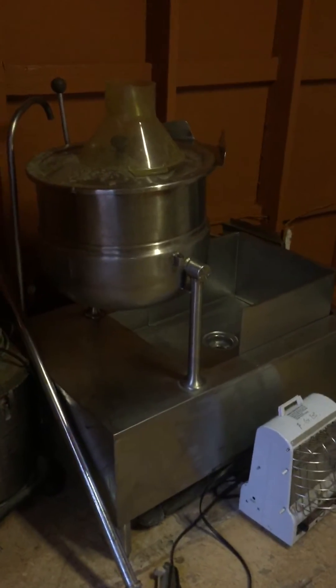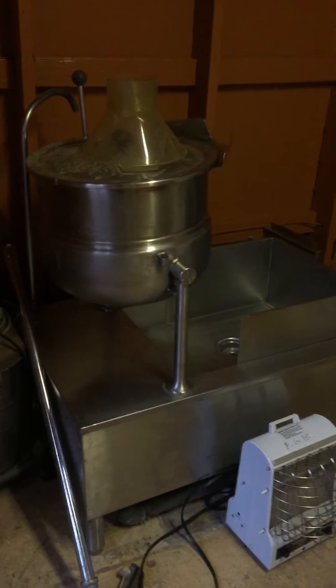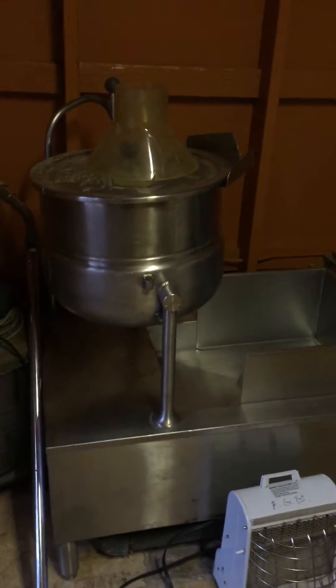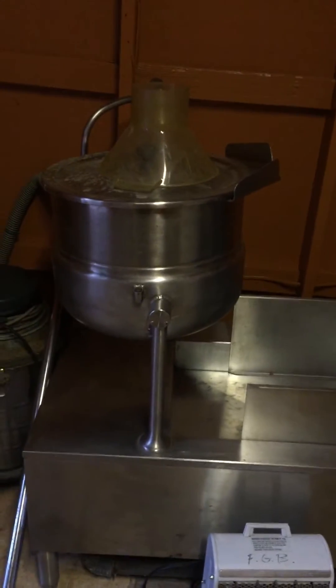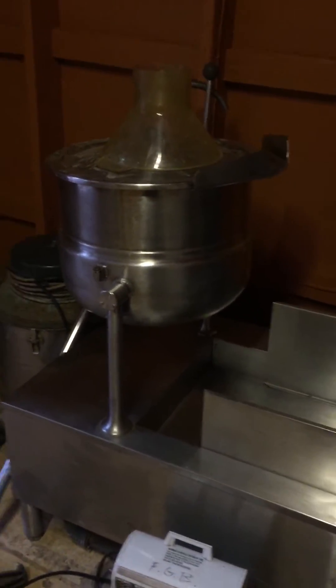Here's our 10-gallon steam jacketed kettle. I got this off Craigslist for a hundred bucks — these things go for quite a bit. So we had to buy a steam generation unit for it.